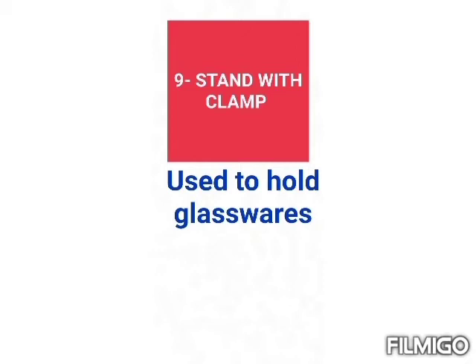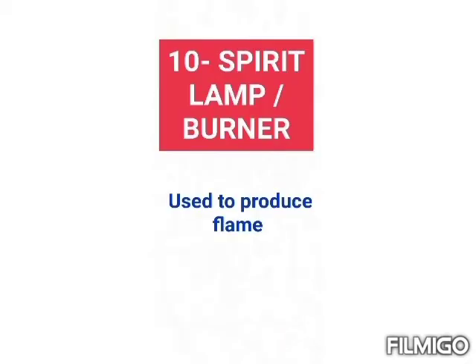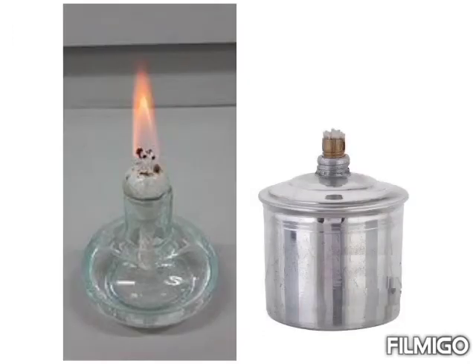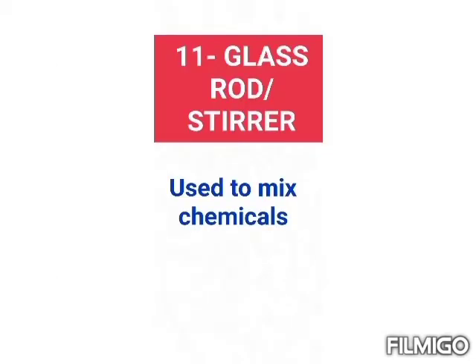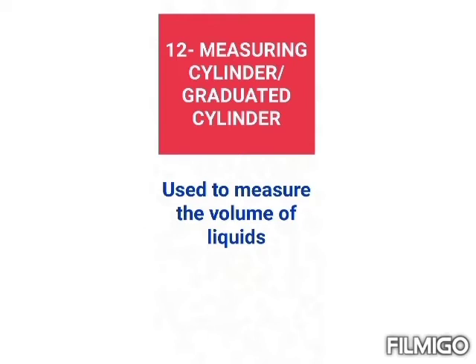Next is the stand with clamp, which is used to hold glassware during reactions. Next is the spirit lamp or burner, which is used to produce flame and uses spirit or alcohol. Next is the glass rod or stirrer, which is used to mix chemicals.